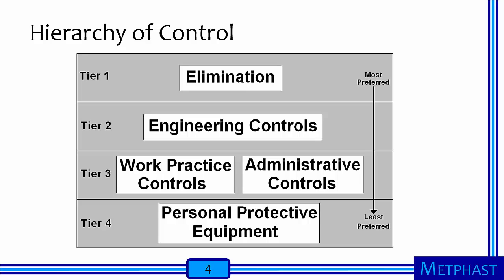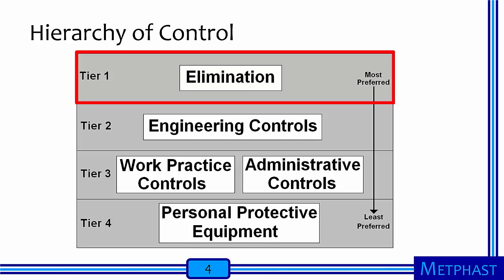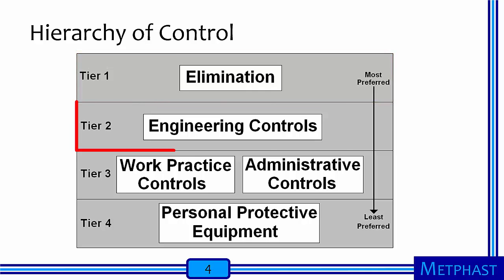Engineering controls fit within the broader context of the hierarchy of controls. The most preferred control is elimination of the hazard from the workplace. Sometimes referred to as prevention through design, hazards can be eliminated by changing the process to avoid certain chemicals, or hazardous chemicals can be substituted for less hazardous ones. Prevention through design works best when integrated in the development of a new process. Engineering controls are also preferred because they can be highly effective without requiring the involvement of the worker. Thus, the use of engineering controls reduces the potential for worker behavior to impact exposures. Ventilation is the primary engineering control.